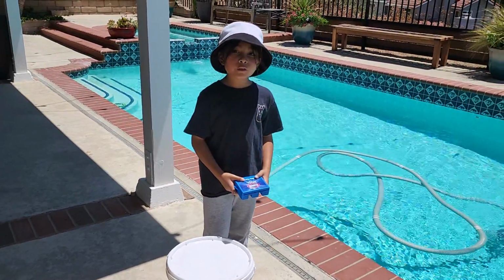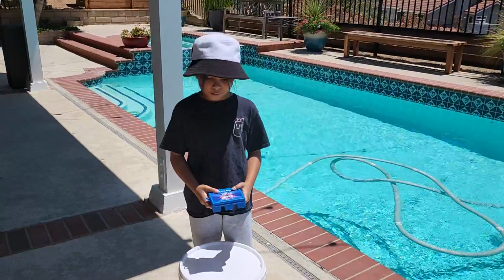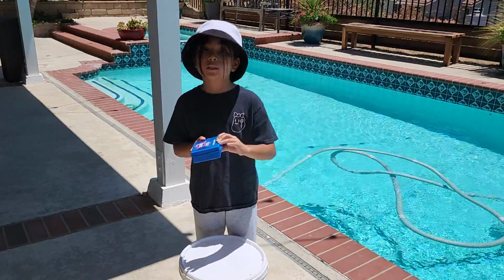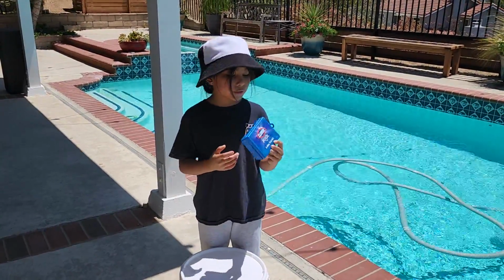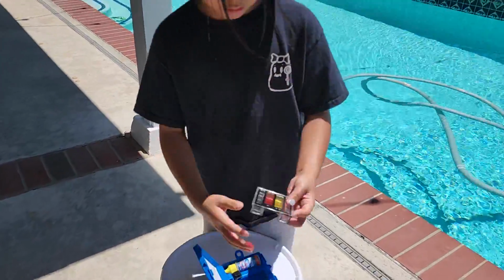Today, I'm going to teach you how to test your pool water for the chlorine level and the pH balance. This is a 3-way test kit. You can buy this at Walmart for $5. Open it, get the small container.